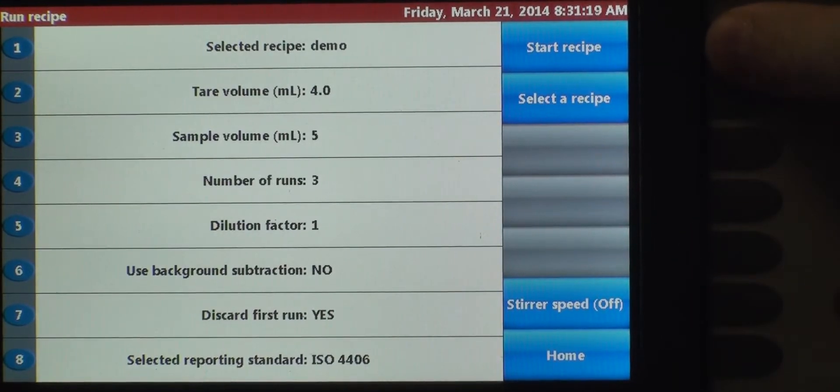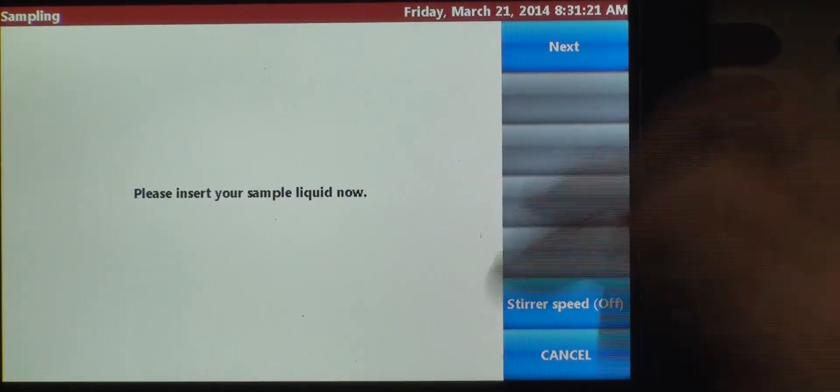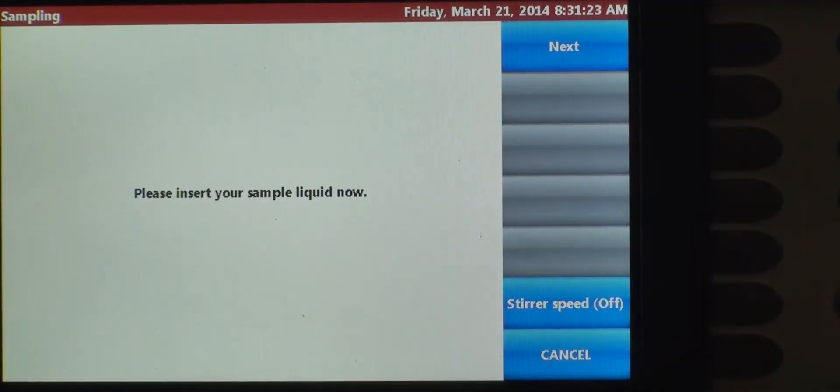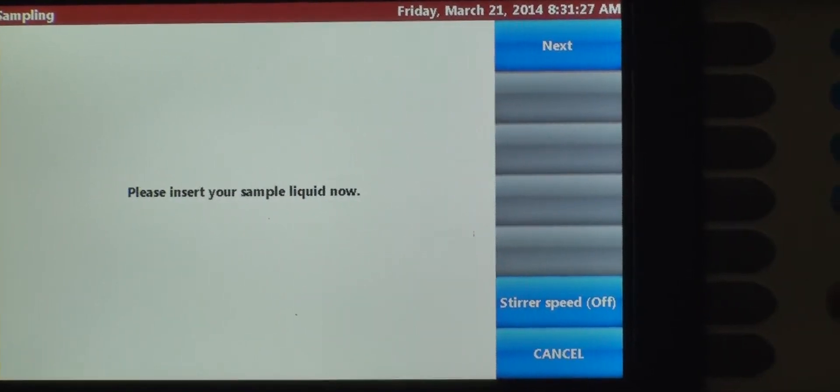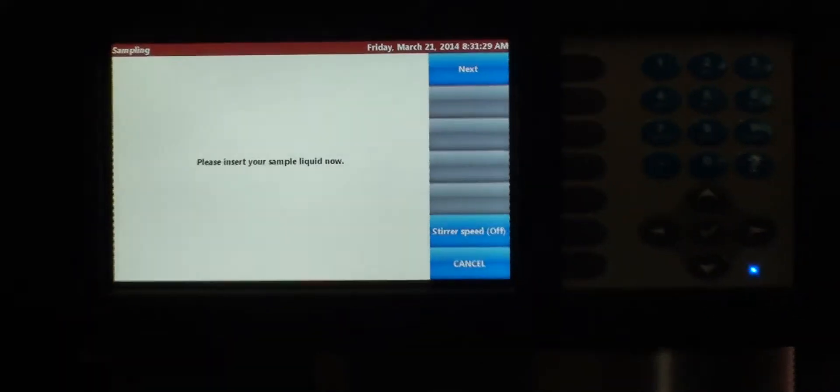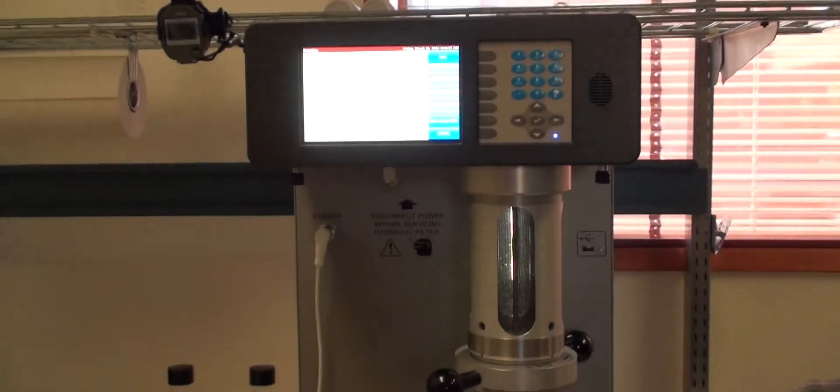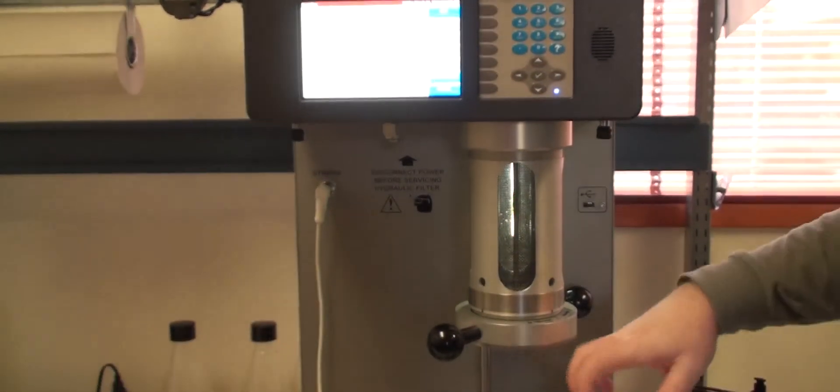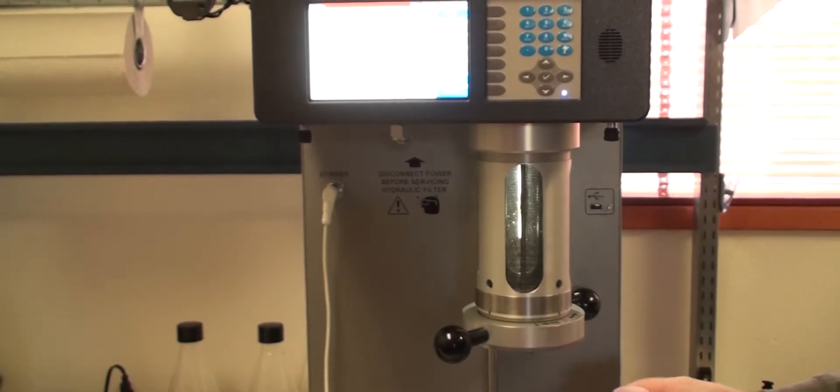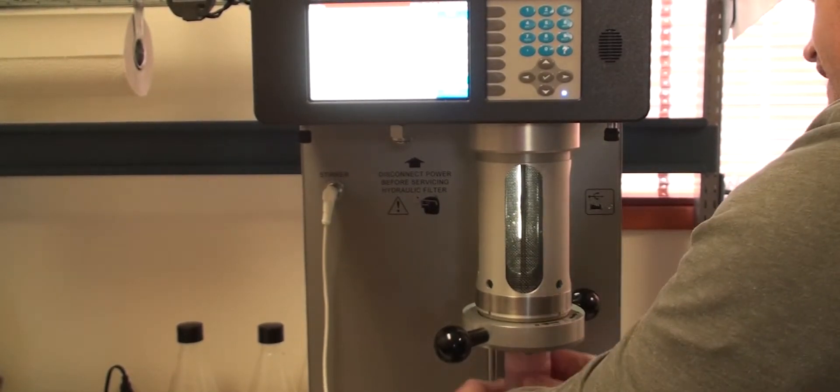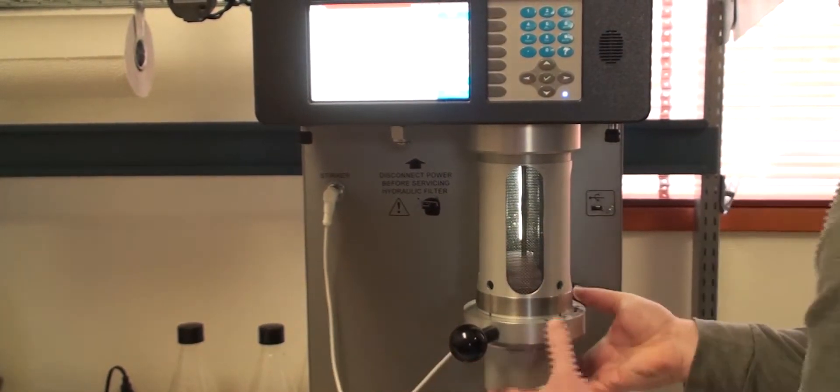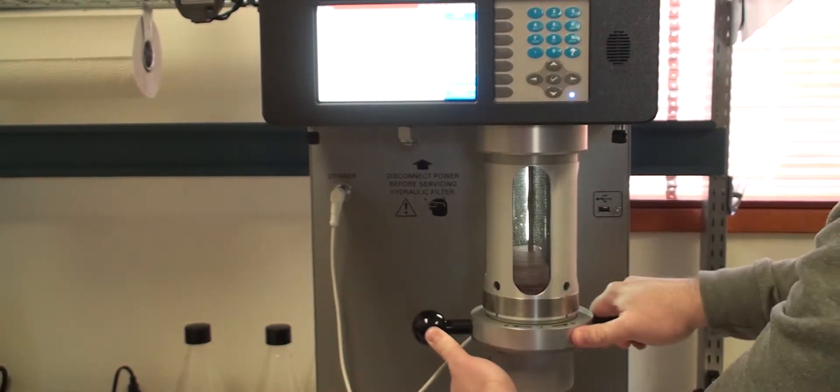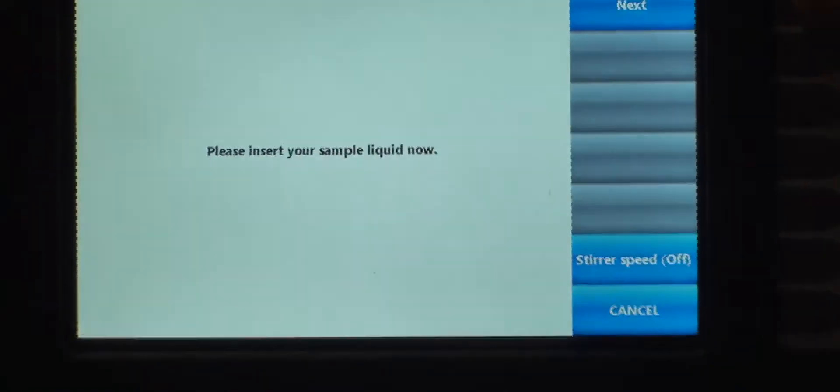Now, we want to start that. It's going to prompt us to insert the sample fluid. We've got our sample fluid here. Get that in place. Hit next.